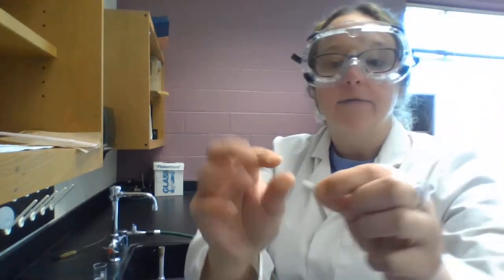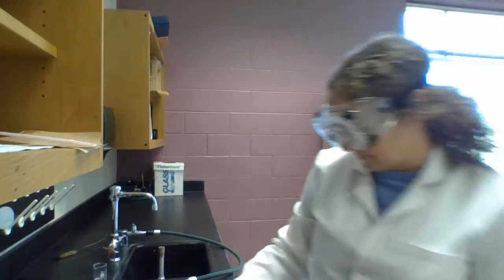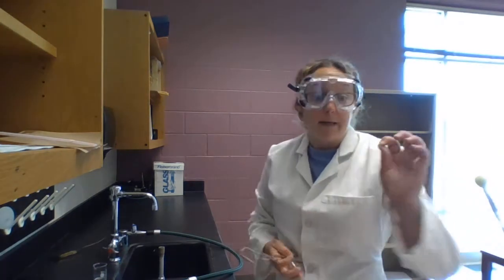So let me get this close so you can see the physical properties, because there's a question about the physical properties. Okay. Now I'm going to burn this magnesium. Now magnesium burns very bright, so we are never going to look directly at the flame because it does burn so bright. The burning of magnesium is also how we get the white color for the fireworks.